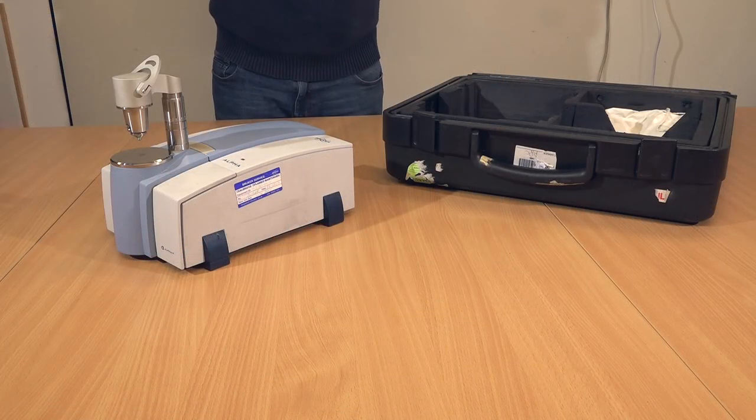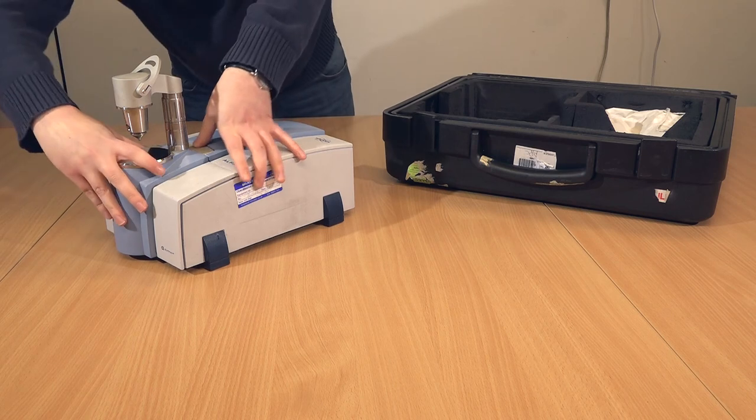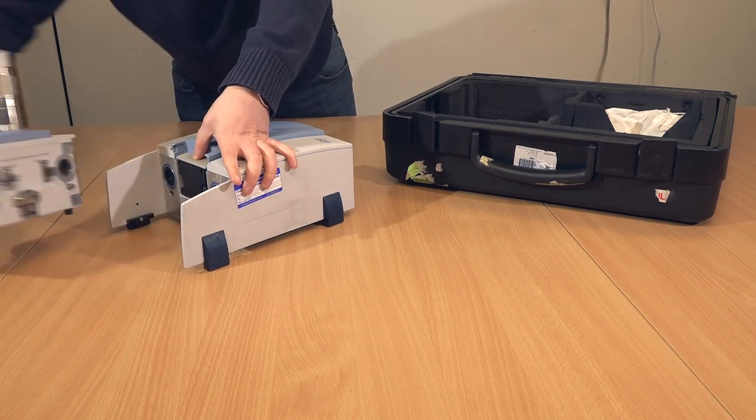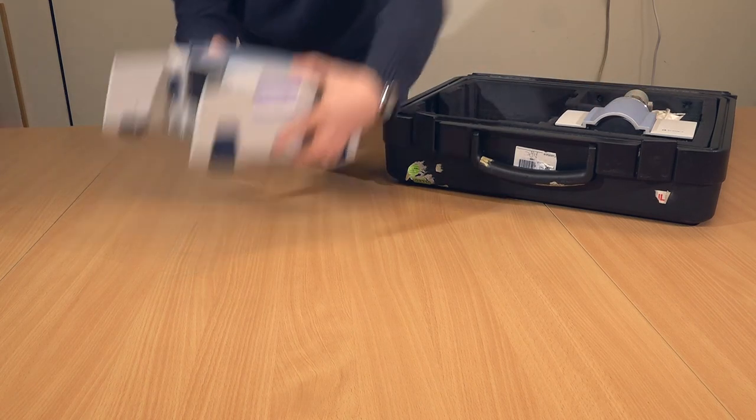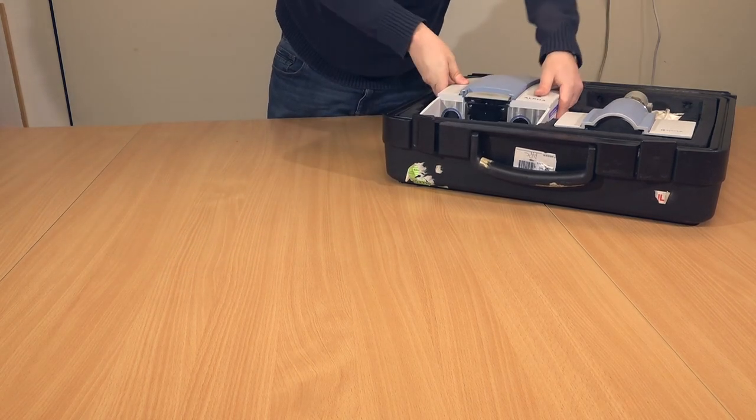Dismantle the IR spectrometer by pushing down hard on the gray button until it clicks. Then slide the front part forward and lift up and away from the back section. Pack the two spectrometer pieces back into the suitcase carefully as shown. Close the lid and ensure both clasps close completely.